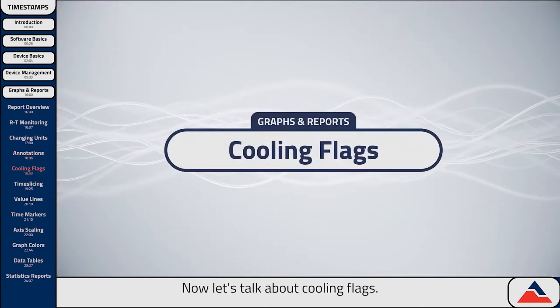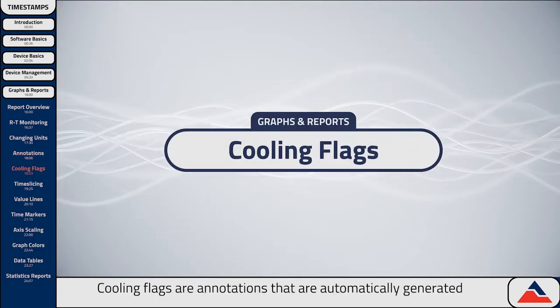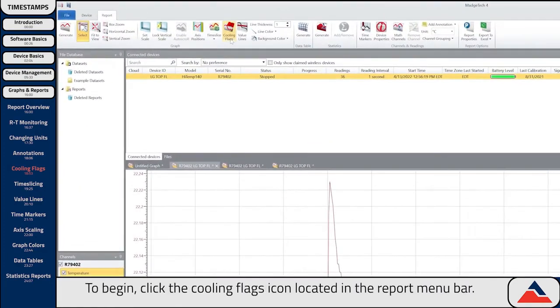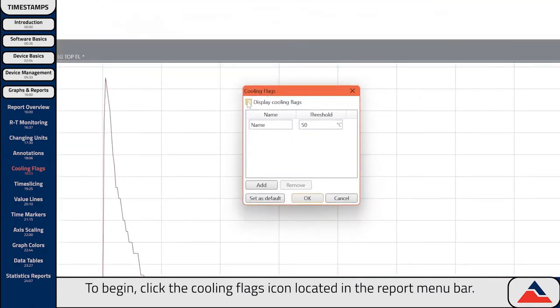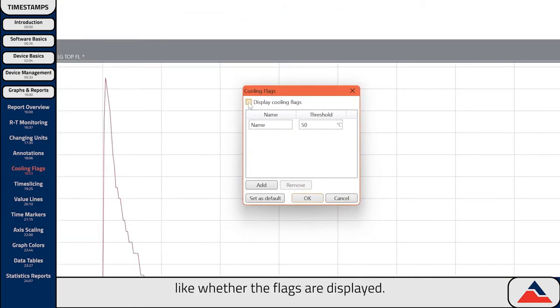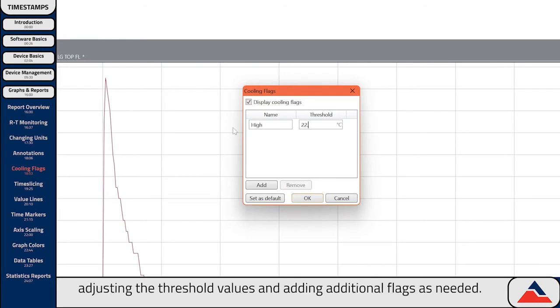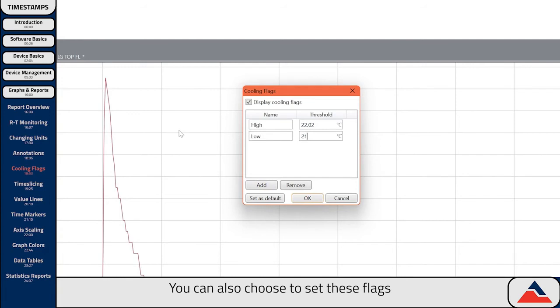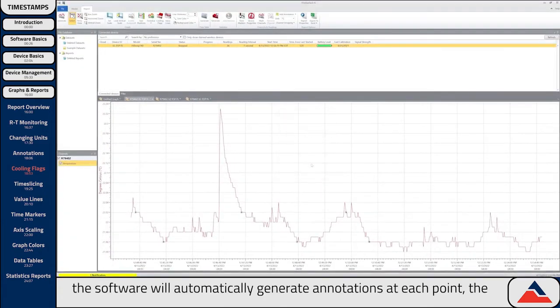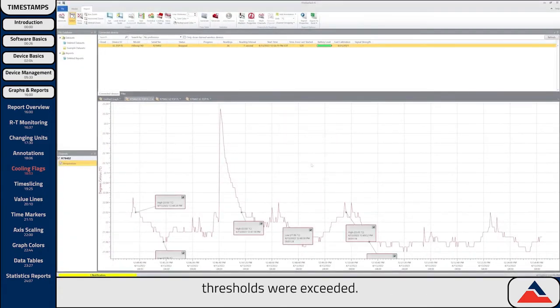Now let's talk about cooling flags. Cooling flags are annotations that are automatically generated when certain thresholds are met. To begin, click the Cooling Flags icon located in the Report menu bar. This pulls up the Cooling Flags window, where you can manage aspects like whether the flags are displayed, the name of your flags, adjusting the threshold values, and adding additional flags as needed. You can also choose to set these flags as your defaults for future projects by hitting Set as Default at the bottom. The software will automatically generate annotations at each point the thresholds were exceeded.